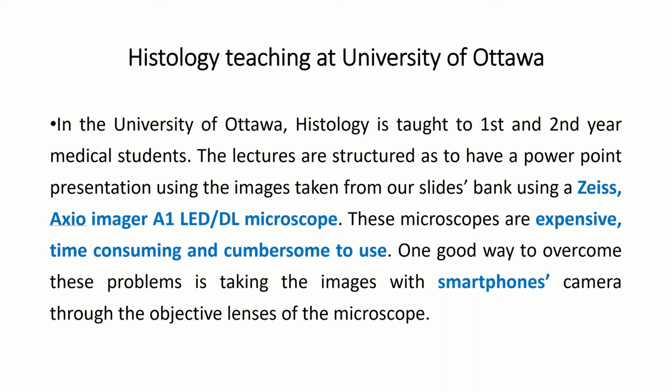Lecturers use PowerPoint presentations containing images of histology slides taken with the Zeiss Axio imager microscope. Unfortunately, the Zeiss microscope is expensive, time-consuming, and difficult to use. For this project, we sought to find a better way to acquire histology images for teaching purposes.